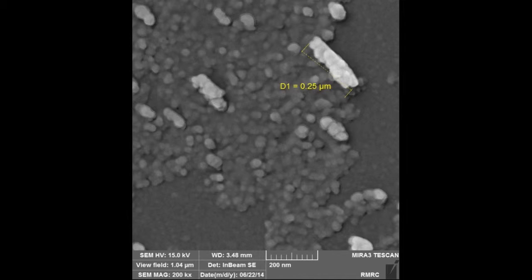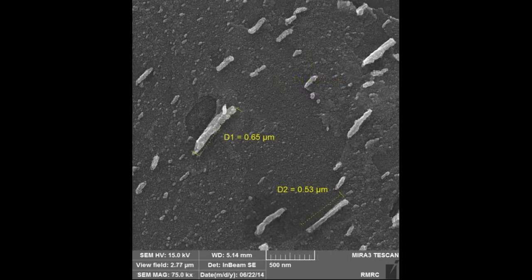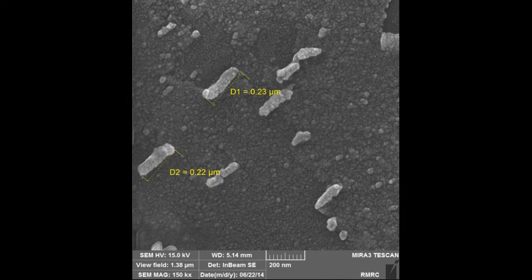X-ray diffraction pattern shows that the annealing process improves the crystallinity of the aluminum doped zinc oxide thin films. The mechanism of blue-green luminescence of aluminum doped zinc oxide thin films is analyzed. Energy dispersive X-rays, or EDX, were used to analyze the composition of aluminum doped zinc oxide films.